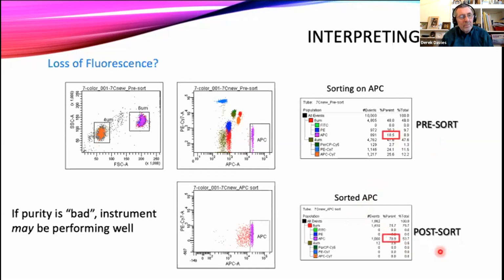As Rui said, we should be able to get 99% purity as long as everything is perfect. But then we have to start thinking about why that isn't 99%. As I say in virtually every webinar, flow cytometry is about numbers and visualization. Now we know our purity is relatively low, and if we look at why, it's because of this population here. This population isn't in the unsorted population at all. It seems to be a new population that's arisen.